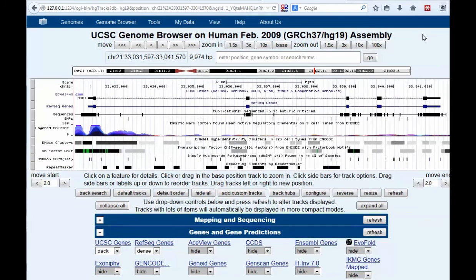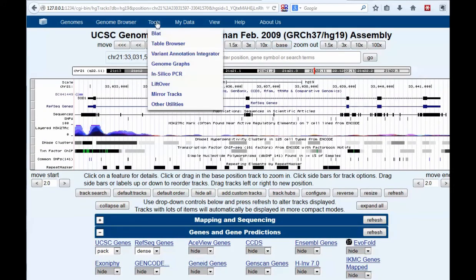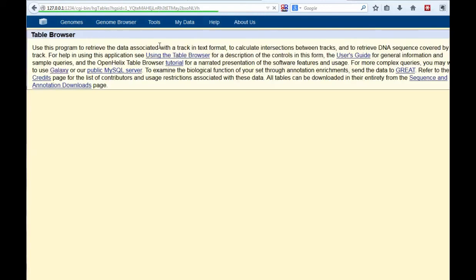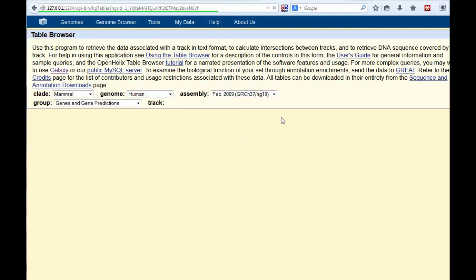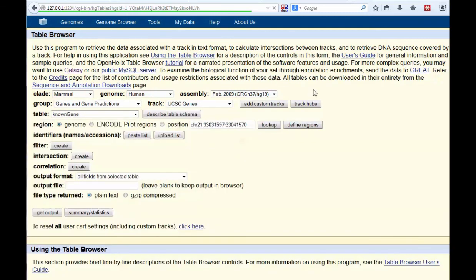Now there are a couple of differences. One of the things is if you go to the Table Browser here, you will have access to it, but because of the way the VirtualBox works there are some features that are a little bit different. From here you won't be able to send a query over to Galaxy — this is something I'm used to doing on the web. So in the Table Browser in the VirtualBox, you don't have the option to send to other tools, because it can't talk to those external tools.